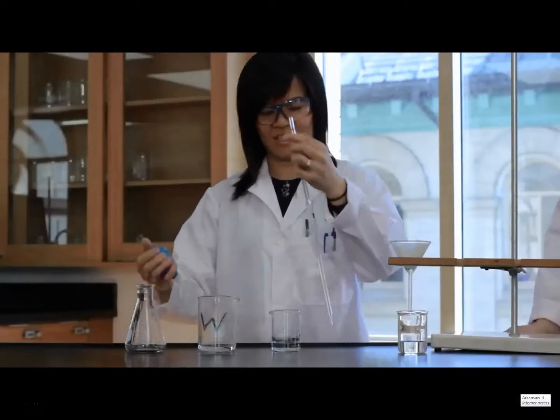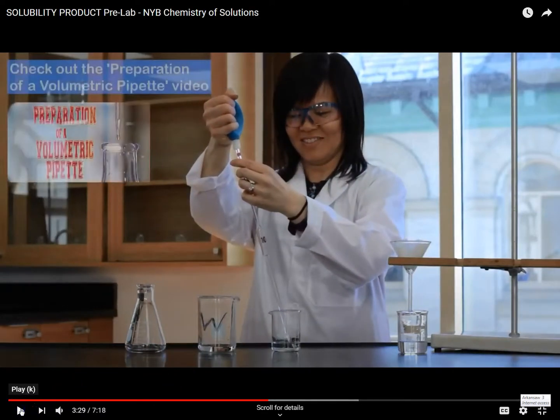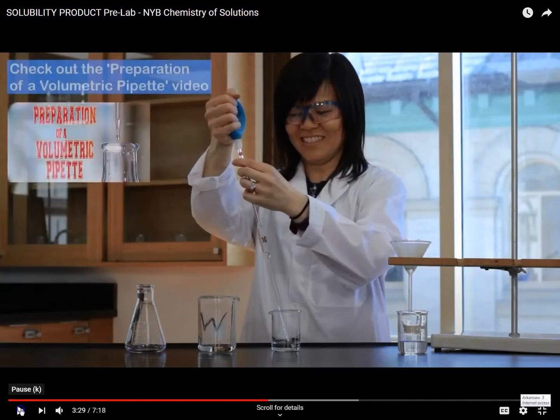Prepare a 10 milliliter volumetric pipette as demonstrated in another video. In ours, we are going to do 25 milliliters. We are going to pull 25 milliliters of that solution that has been filtered.